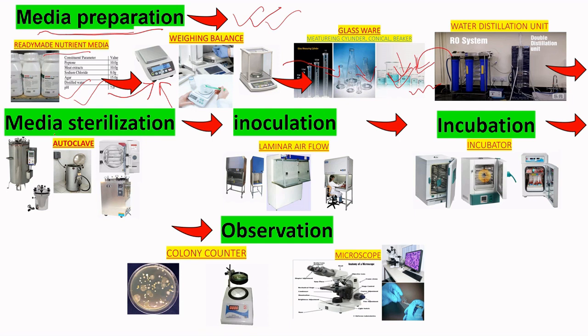So the next step is media sterilization. How will we do the media sterilization? Media sterilization is done by autoclave. Through this autoclave we will sterilize our media, so no microorganisms are present in our media. So the media is totally sterilized for testing or for the next step.